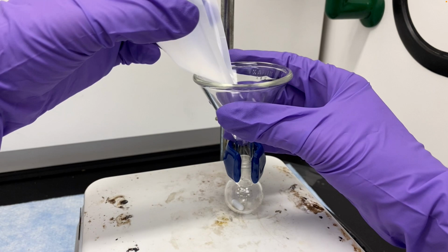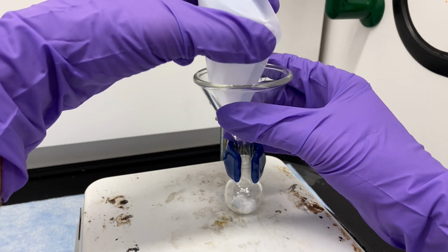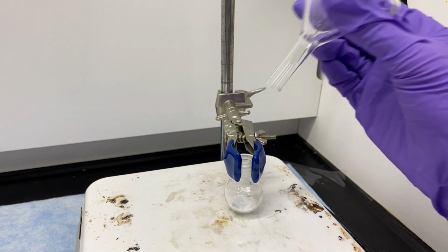Also, a mistake I'll often see when students transfer things from a weighing boat is they'll try to scoop it out of the weighing boat, maybe with a spatula, which is very time consuming and you lose a lot of solid. Instead, these weighing boats are made to be bendable so that you can make one of the corners a sort of spout. So you bend the weighing boat in half and then you can pour it, and that gets pretty much all the solid in the flask.